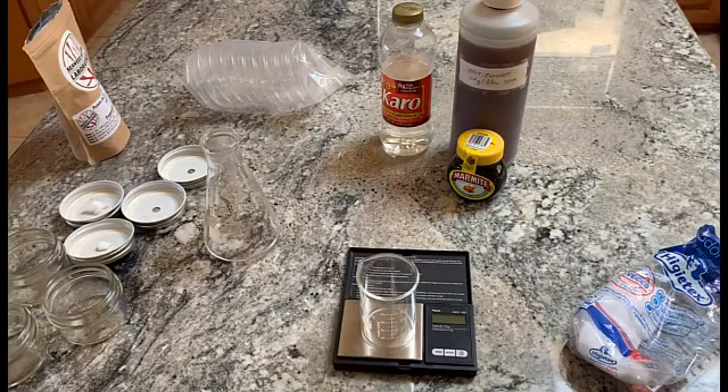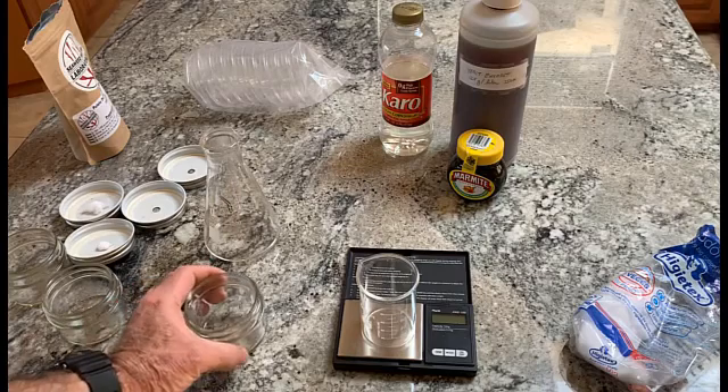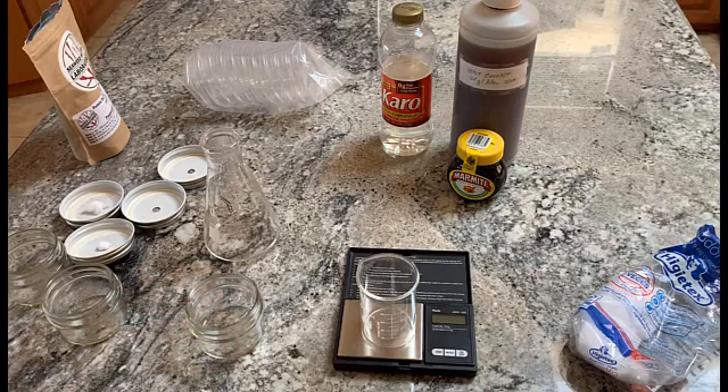Greetings, Dave here. I'm going to make some agar plates today. Over the years I've found that if I add a couple of supplements to regular potato dextrose agar I get better growth in general, and I call it high-performance agar.